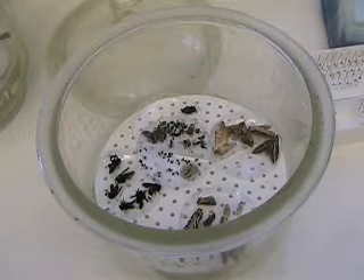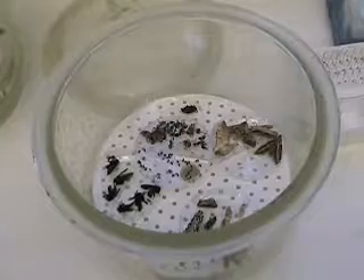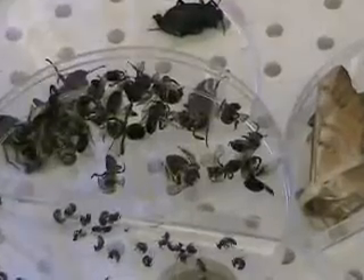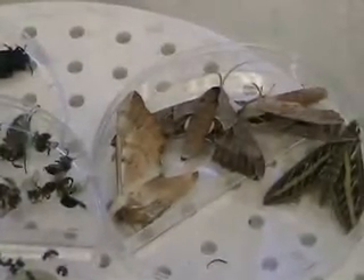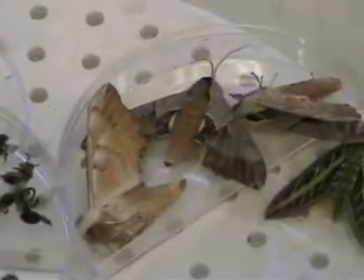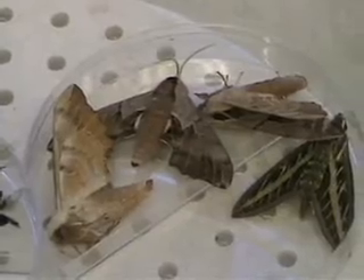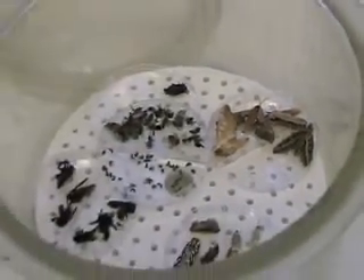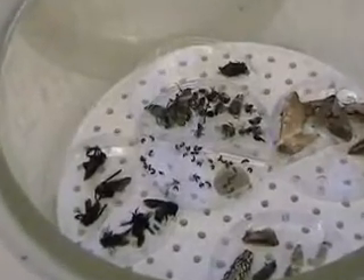In this bell jar, I have various insect specimens — I have moths, beetles, bees — and they are sitting on these petri dishes. In this bell jar there is liquid, and this liquid is water mixed with Windex or 409, some kind of chemical, and it prevents algae and mold from growing on the specimens.